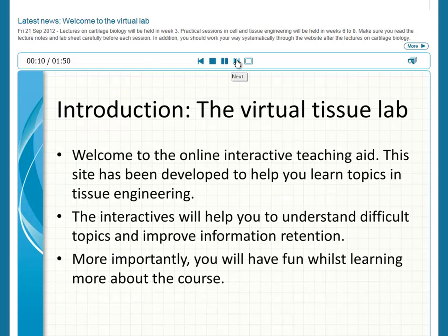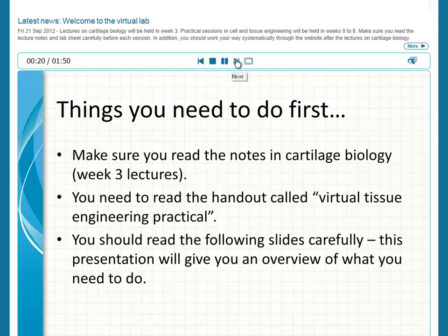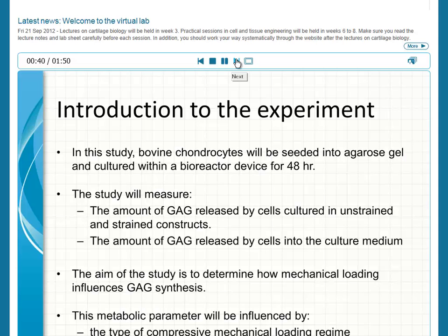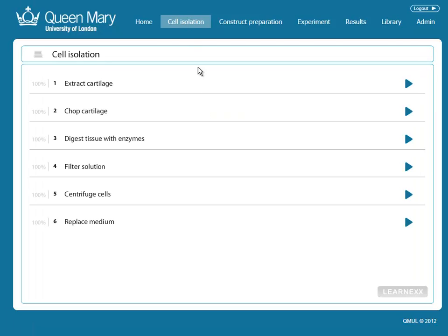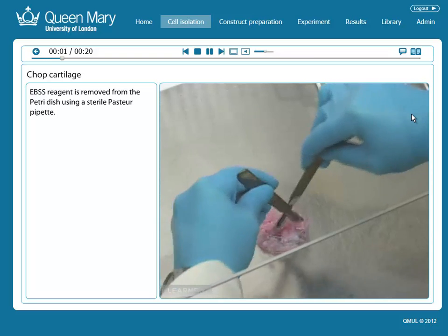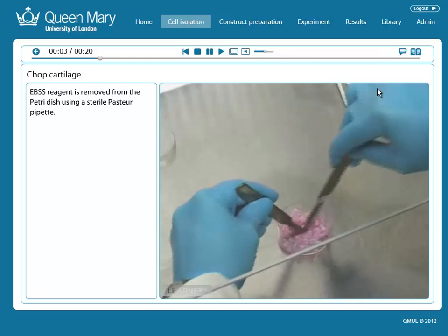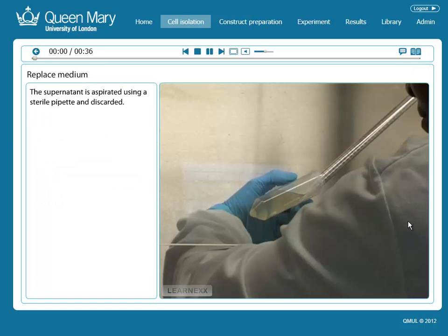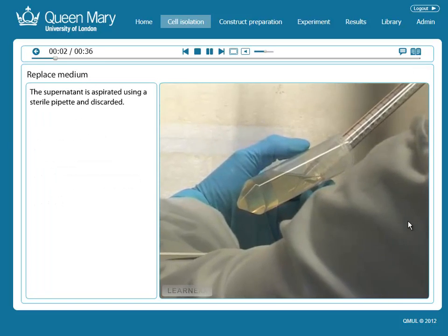Students are provided with presentations, videos, and all the reference materials they need, all integrated together into one environment. Presentations are used to introduce topics and explain what students are expected to do, and videos show parts of the process not covered by what is, for many students, the most attractive element — their own LearnX 3D Virtual Lab.